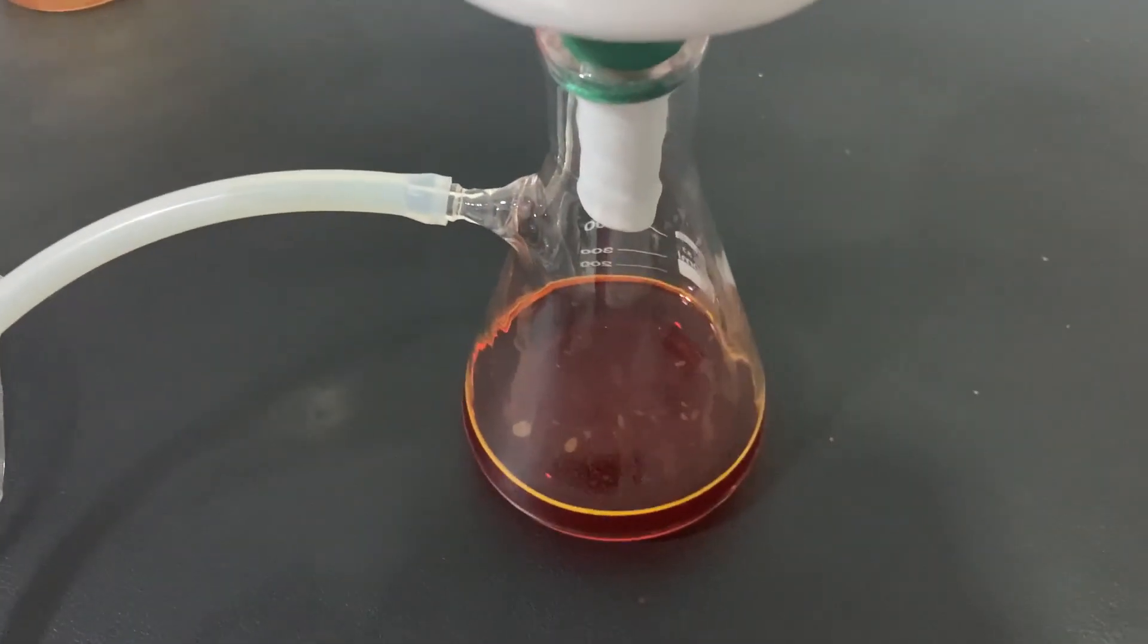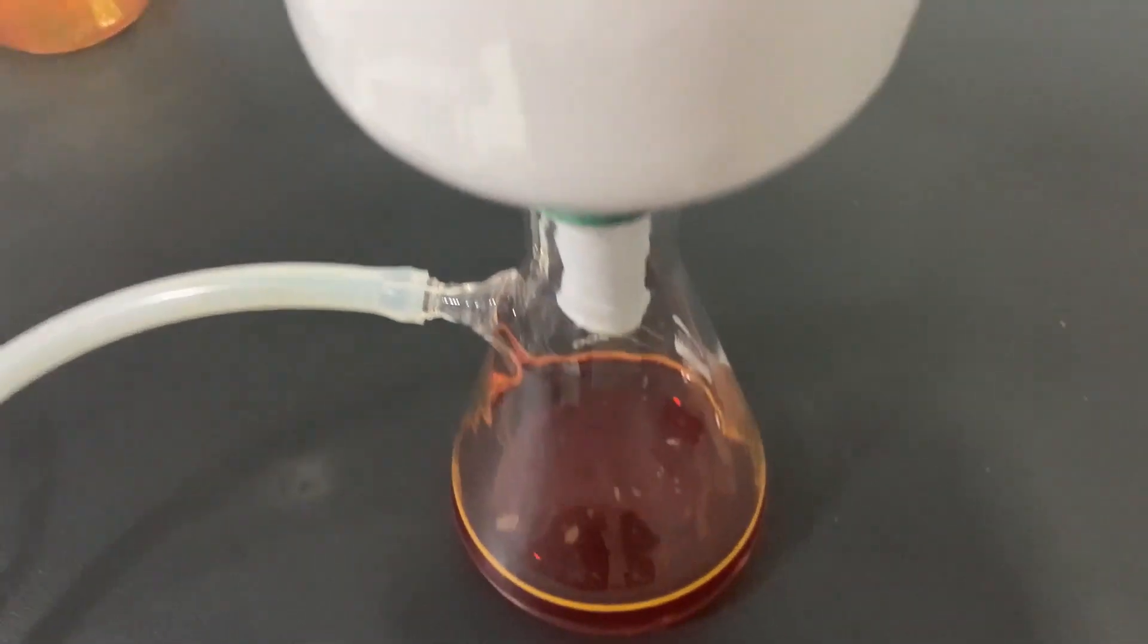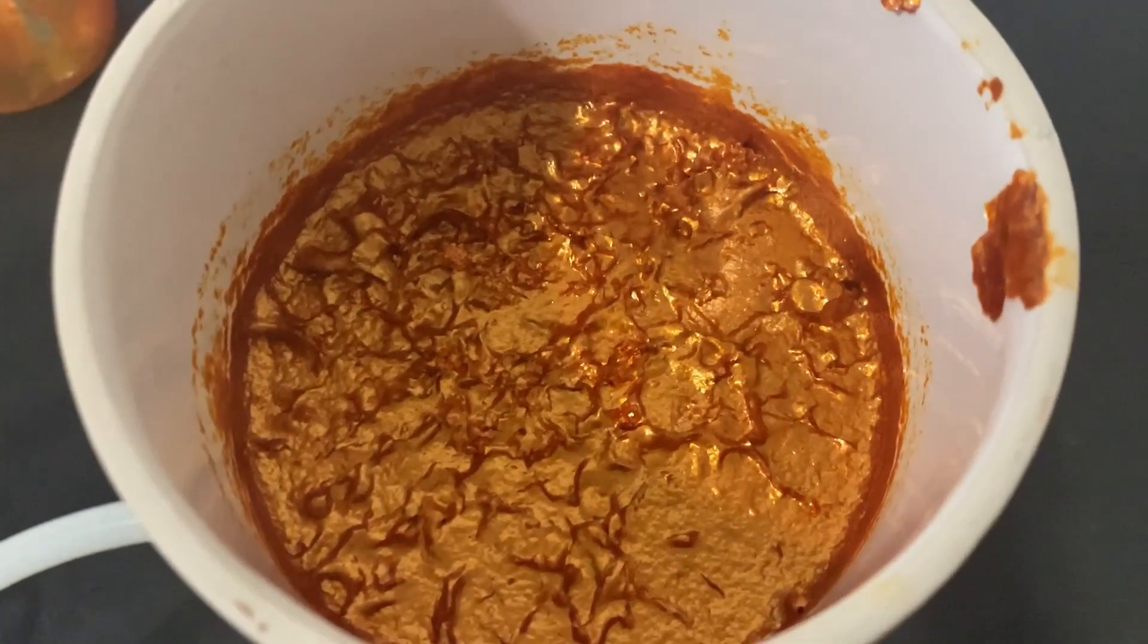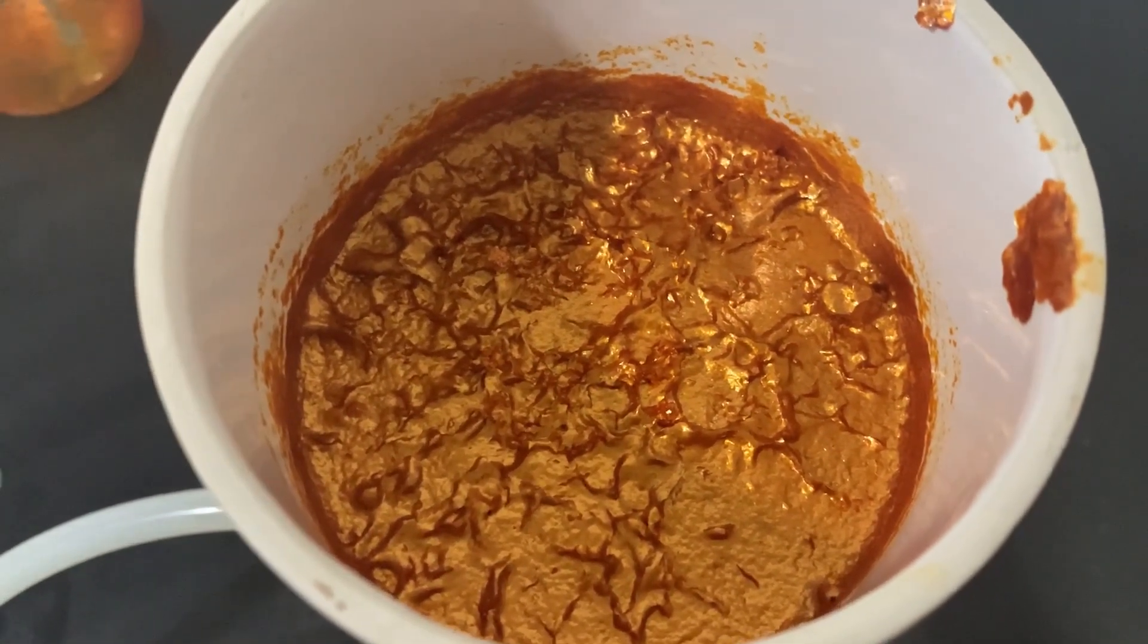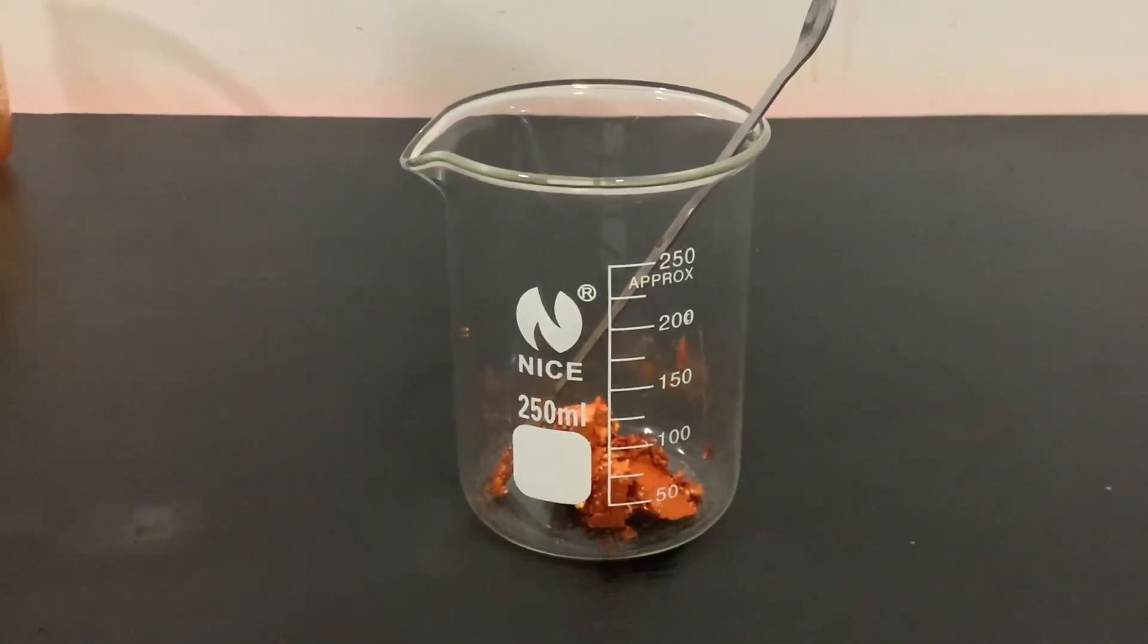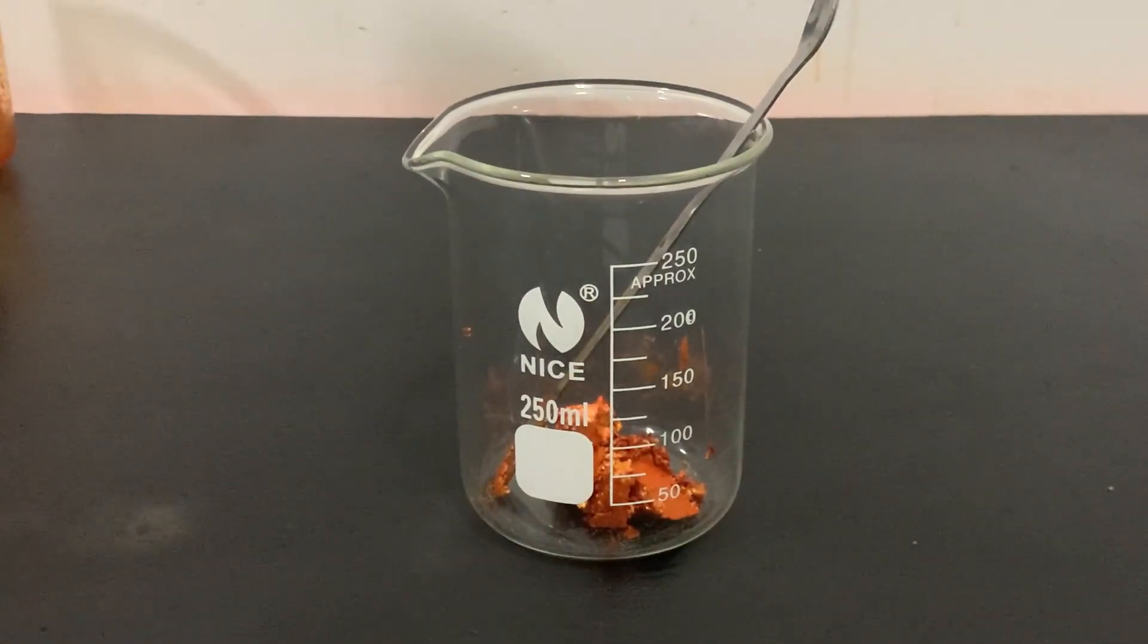Another vacuum filtration is done to separate the pure methyl orange. I transferred all of the wet methyl orange to a beaker and dried it in the oven for a few hours.